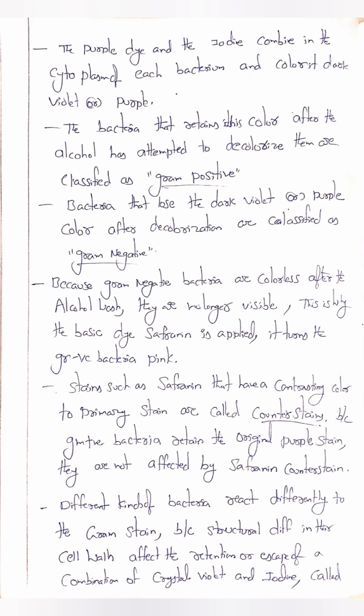Stains such as safranin that have a contrasting color to the primary stain are called counterstains. Gram positive bacteria retain the original purple stain. They are not affected by the safranin counterstain.